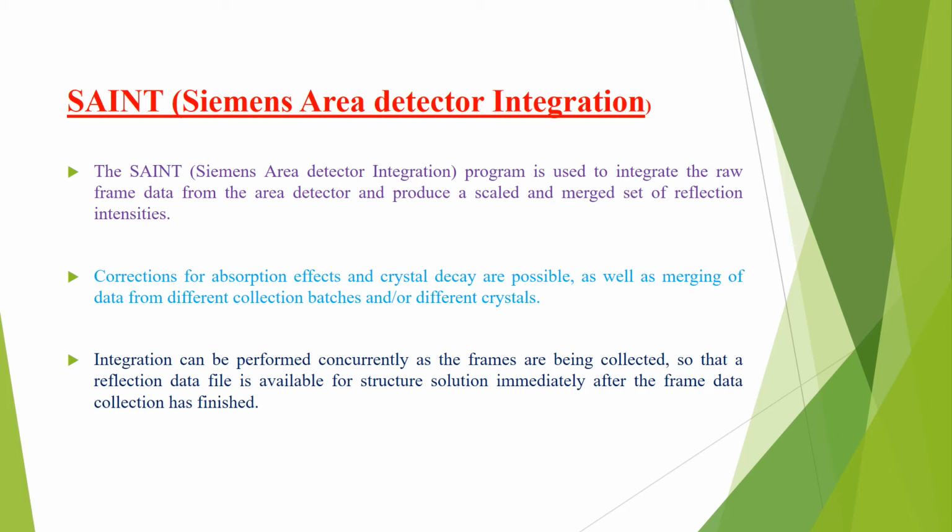After operating the XRD instrument, which provides the different kinds of scattering and diffraction patterns, these different softwares are used to obtain the real crystal image from that single crystal.